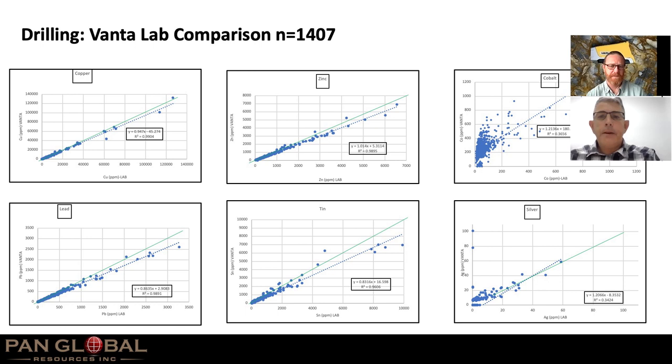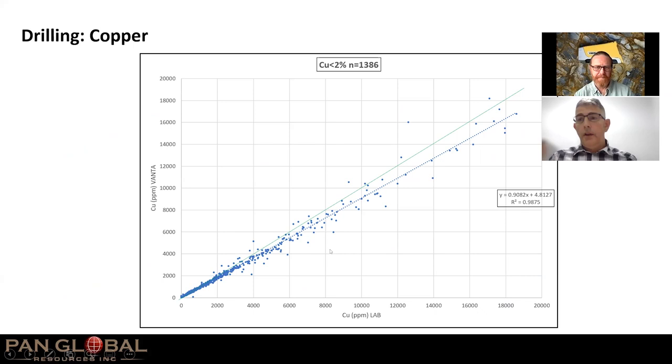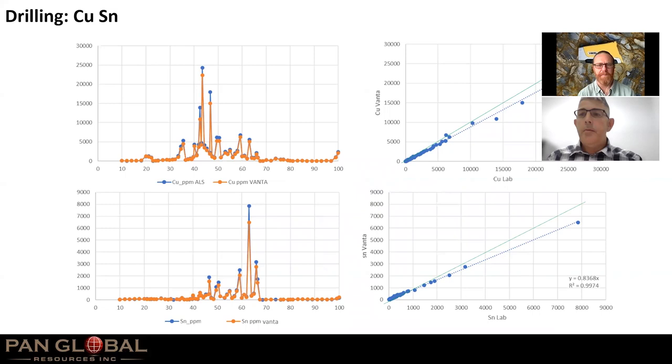Okay, let's move forward. I think this slide here is just a zoom in where we're looking at this part in copper, just having a look at the lower end, just so you can see how good the data is. So again, this is just analysis of the pulp. We don't put it in a puck. We don't do anything to it. We just wind the bag up and put it in the analyzer. And fantastic. If I went down to 0.2, it would show exactly the same spread. Probably a difference of about 10%. Fabulous. Yeah. Copper's always been one of portable XRF's best elements.